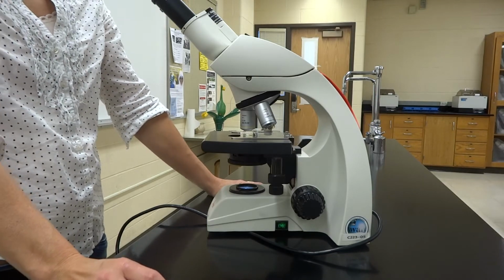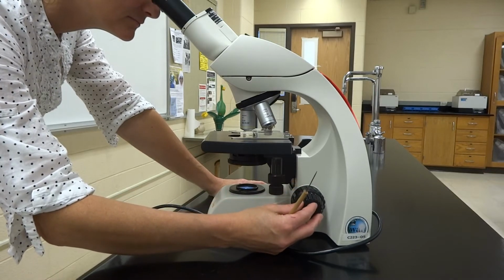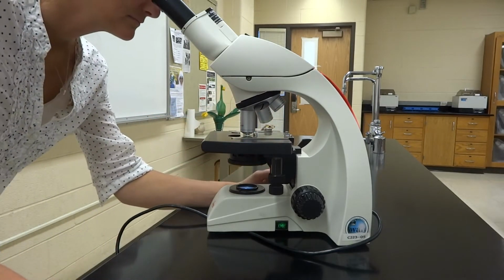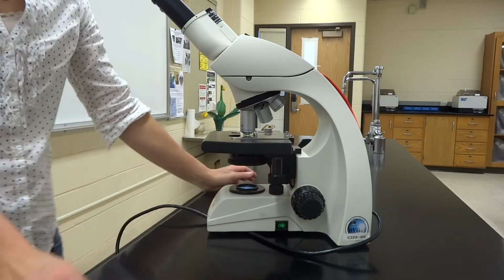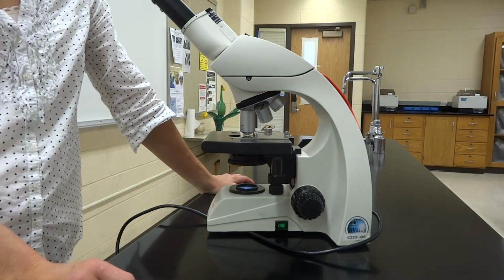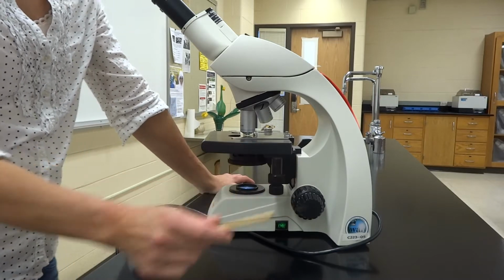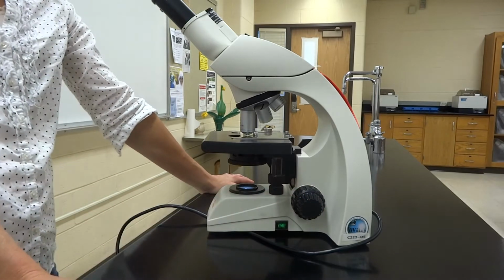So you'll just move that, which will zoom in on our little specimen. And once you get it picture perfect there, we should be able to slide right into 40x again using the nose piece, sliding over, and because our microscopes are awesome, you will not hit the slide with our 40x objectives. A lot of people are worried that it's not gonna fit, it'll fit. So then when you get there, again, don't touch the coarse objective ever again. Fine focus only. And when you get your fine focus, you should only have to move it just a bit most of the time in order to get your specimen into picture perfect focus on 40x.